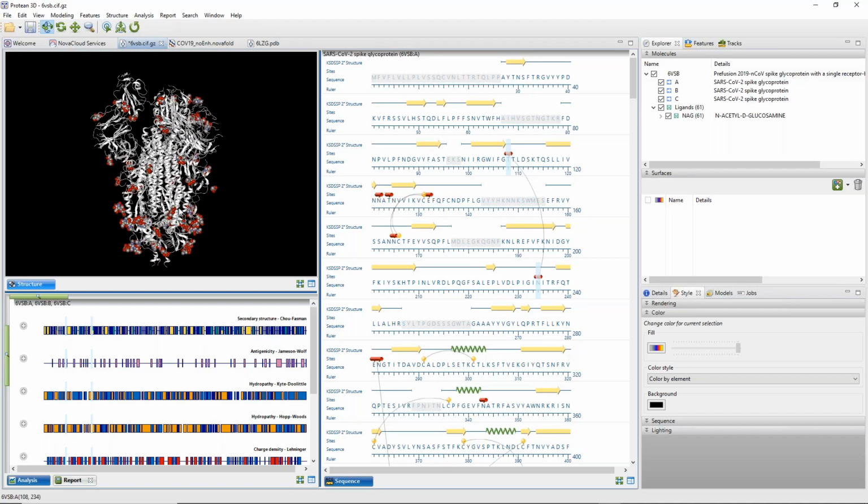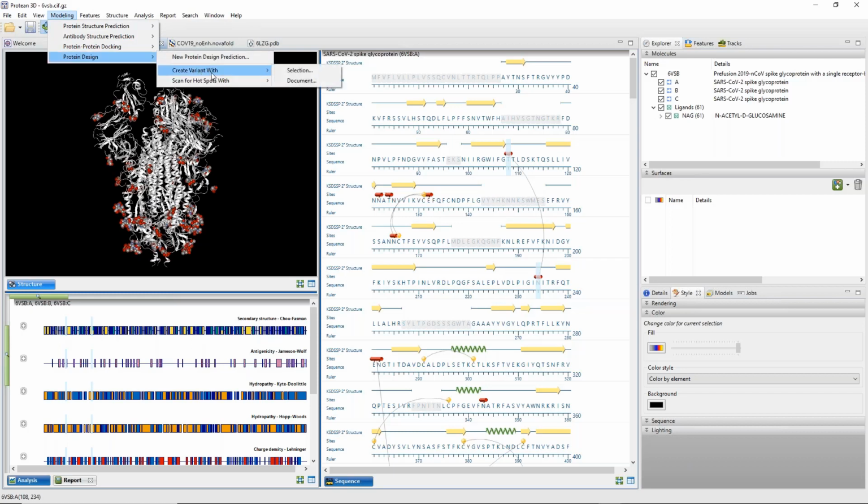Now, also, a lot of you may be working on NGS projects or Sanger sequencing projects, looking at variants in the spike protein and getting ABI files or NGS data. One thing to consider when I show you all this information in this workflow is that all of that data can be used to further refine models that we have. If we can create a predicted model and then you can find some variance in your Sanger or NGS data, we have a modeling workflow here that lets us model those variants into the structures.